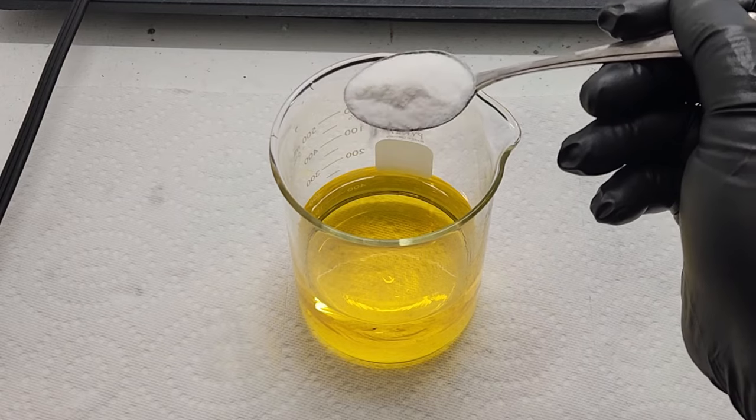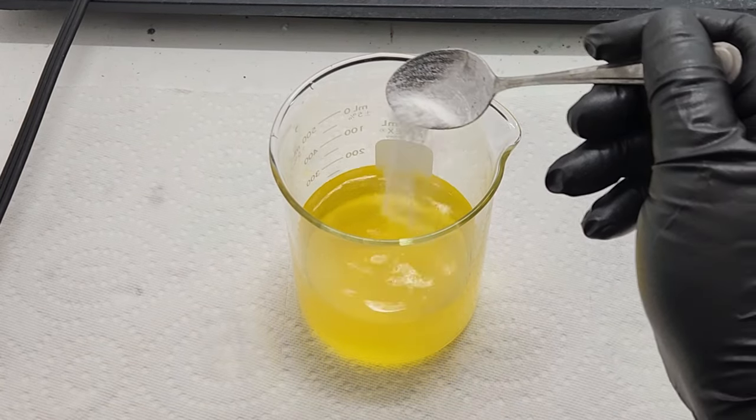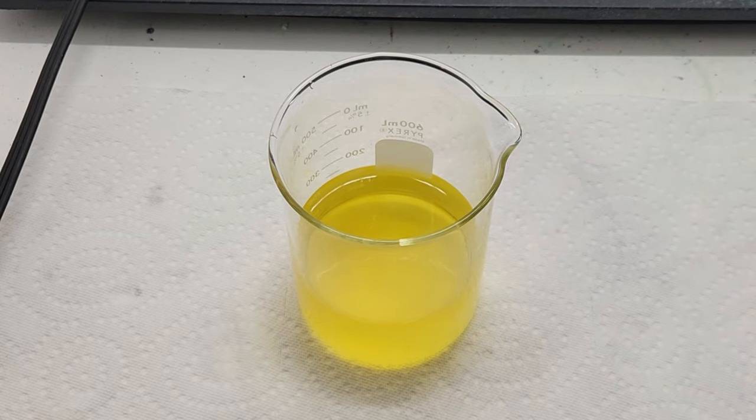Using sodium metabisulfite, we precipitate our gold out of solution. This is where the importance of using the correct amount of nitric acid to dissolve our gold in the earlier step becomes crucial. An excess in nitric acid can cause problems here and is remedied by evaporation or additional sodium metabisulfite.